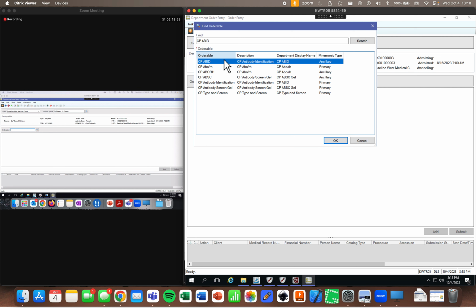So we're going to start by searching for our orders. Let's do my type and screen first, my care set.